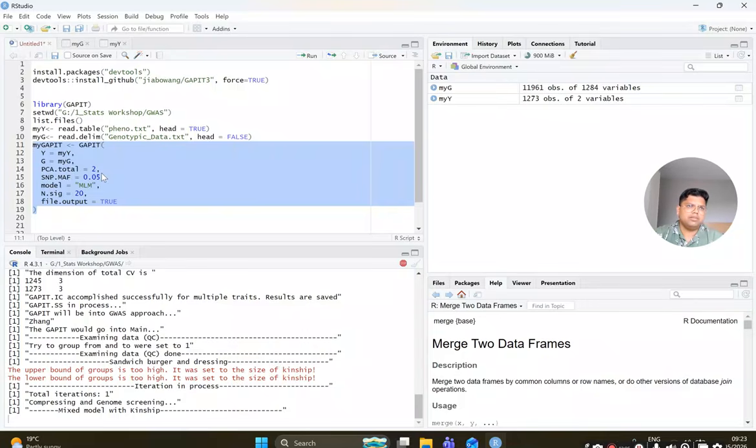You can check it again, and you can set the thresholds. So usually more than five. A minus log 10 p value of more than five is usually considered now, and stable MTAs are very important in the GWAS.